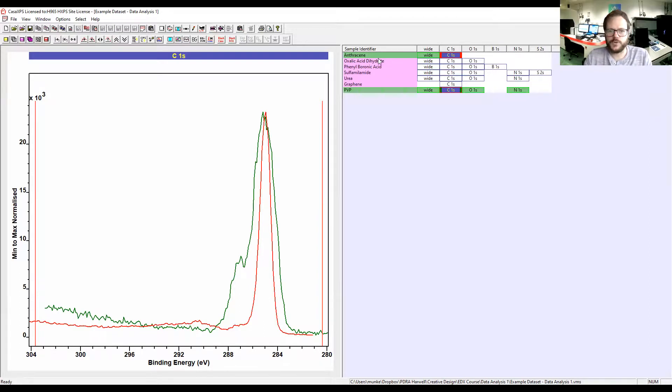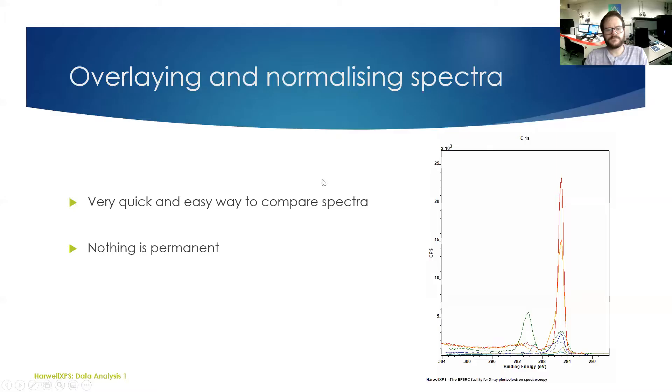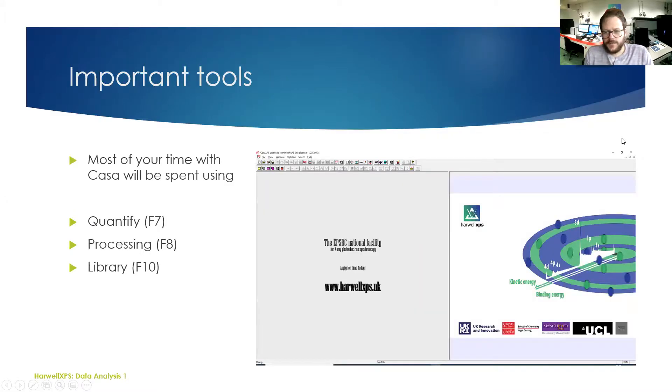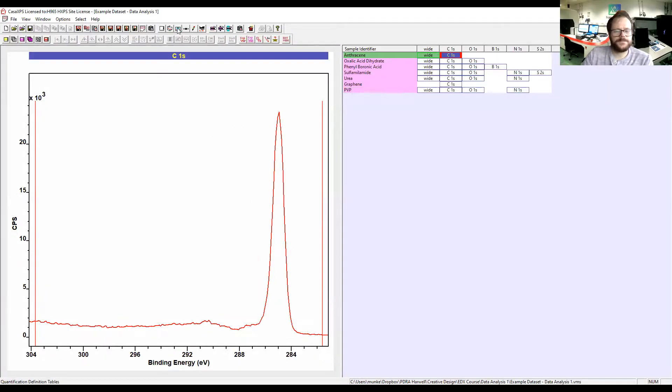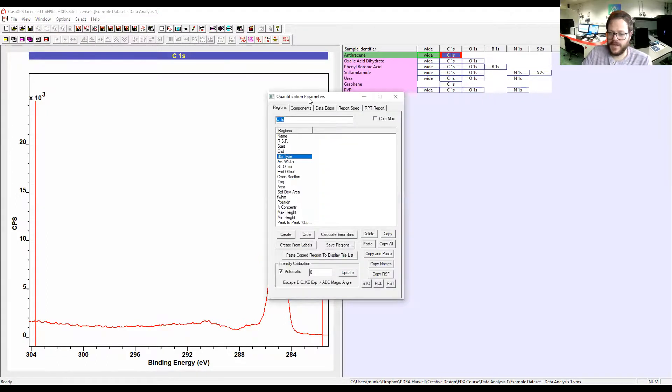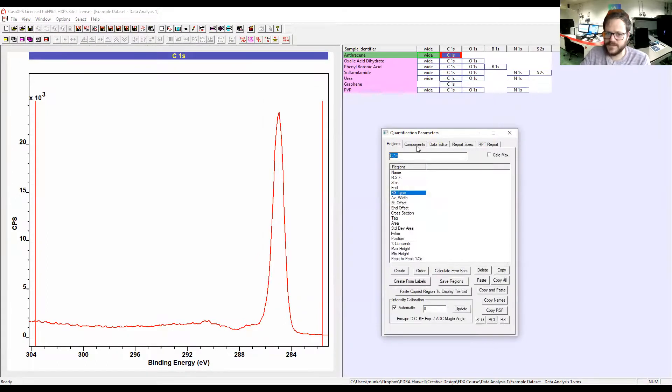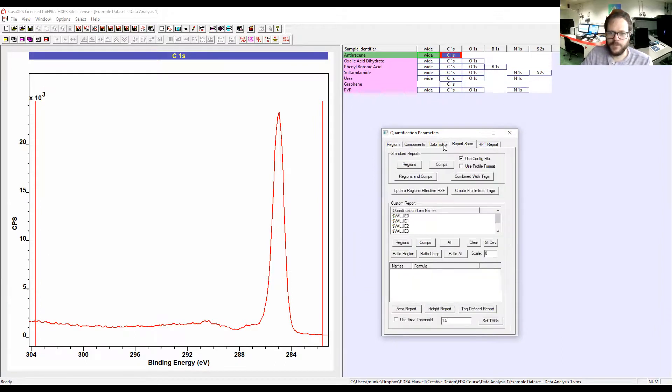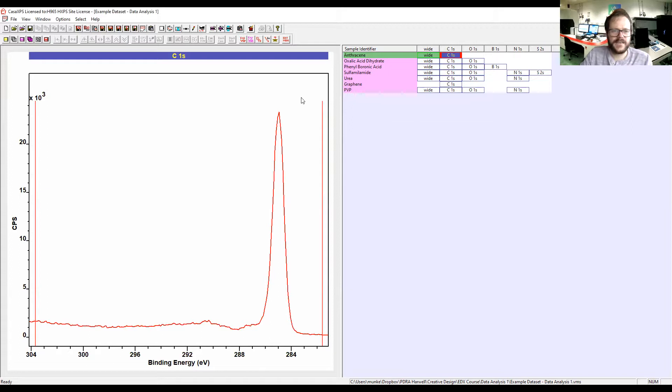Some of the most important tools in Casa are Quantify, Processing, and Library. You will probably spend the vast majority of your time in Casa using Quantify realistically, but also Processing and Library are very useful. If we go back to our software, up here we have Quantify and this opens up another window in which we can do all sorts of things such as putting in peak models, generating reports. These will be covered in an upcoming part.